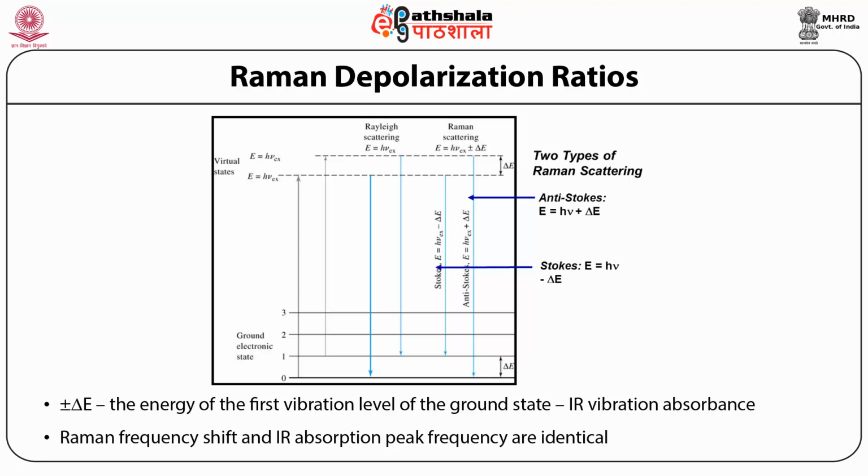Light striking a molecule with such a bond can be absorbed and then re-emitted at a different frequency. We call it the Raman shift, corresponding to the frequency of the vibrational mode of the bond. If the molecule is in its ground state, upon interaction with the probe beam, the light can be absorbed and then re-emitted at a lower frequency, since energy of the light is channeled into the vibrational modes of the molecule. This is referred to as Stokes shifted Raman scattering.